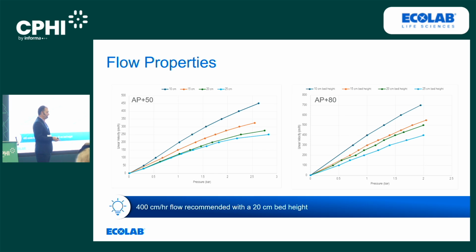At that bed height, we're running flow velocities ranging between 300 and 400 centimeters per hour. This is quite a respectable flow rate for running the process, at least for a capture step.